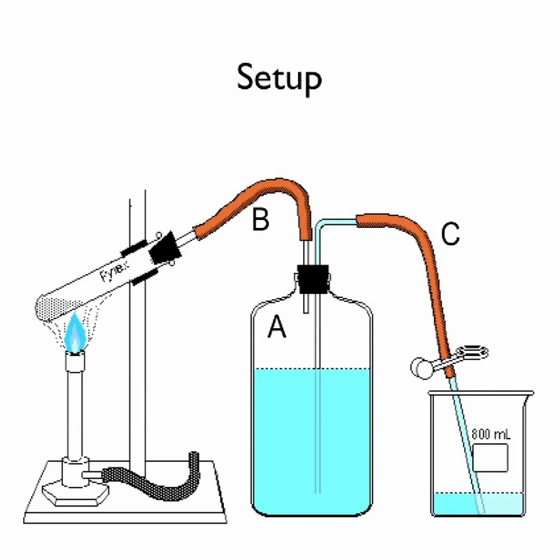If it begins going fast, over a few drops per second, then you will need to remove some of the heat. When you note no further reaction occurring by observing the water level in the beaker, heat the tube for an additional 5 minutes and then allow it to cool to room temperature. Raise the beaker or the flask until the water level in A and the beaker are equal. Close the pinch clamp. This ensures that the pressure inside the ignition tube is equal to the atmospheric pressure. Your instructor will demonstrate this procedure.